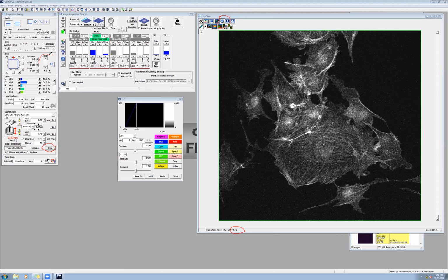So let's say, for example, if you have a camera and you physically go closer to somebody, right? You physically go closer to somebody. That's what this zoom button is doing. And let's say if on your phone, you are just pinching and enlarging something, that's what the digital zoom is doing for you over here, right? So right now I'm just zooming in.